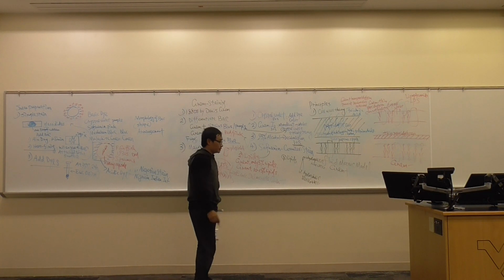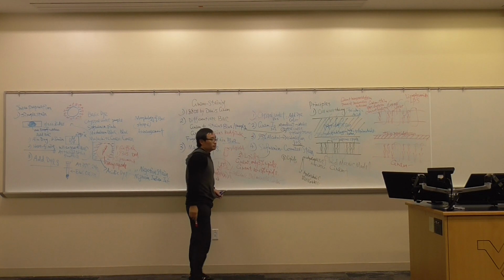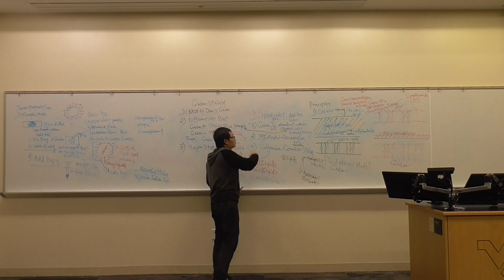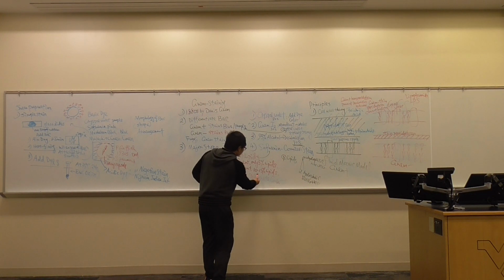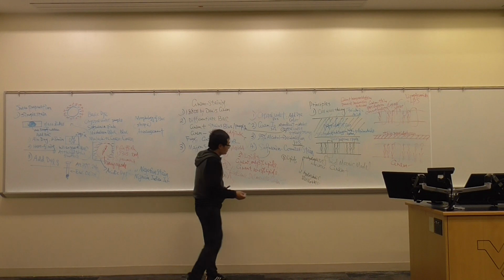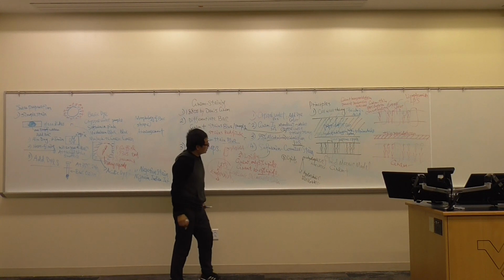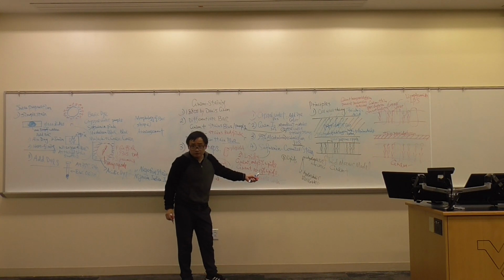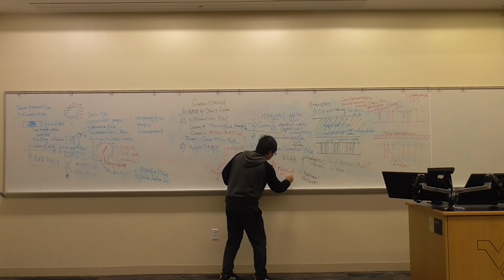So what's the story here? I add crystal violet iodine. That's good. It stays purple. I have that high amount of lipids. And for decoloration, I use alcohol. Remember, lipids will not dissolve in water, but lipids dissolve very well in alcohol.